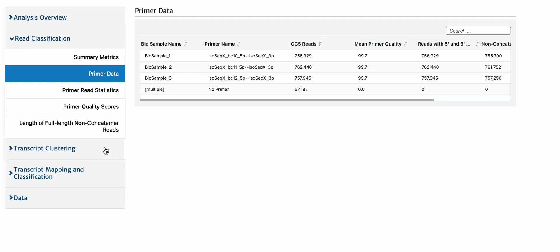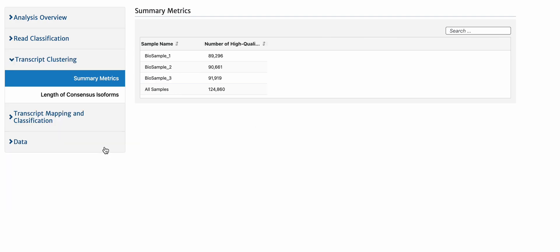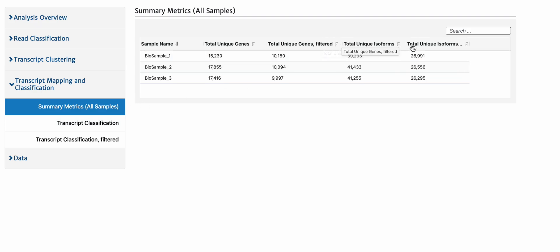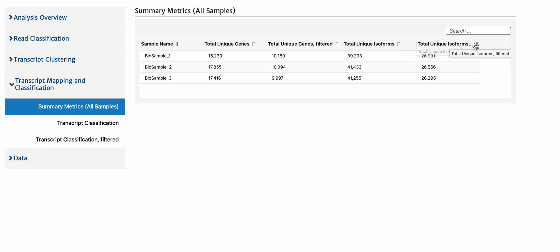When we look at clustering, it does show the per sample cluster results. It also shows the summary metrics, the number of genes before and after filtering, and isoforms before and after filtering for each sample.